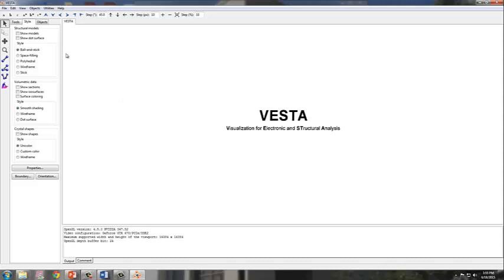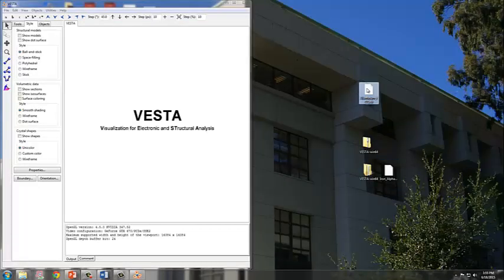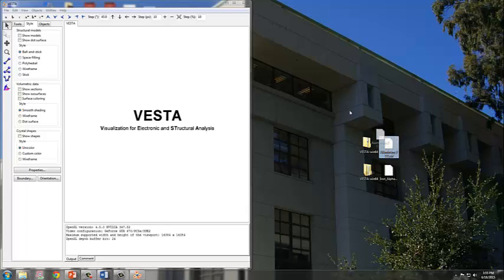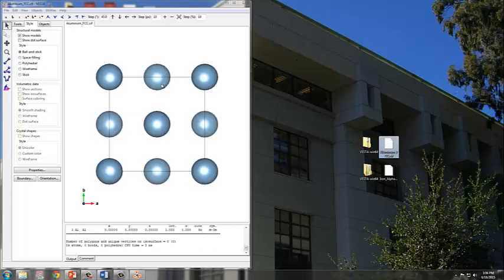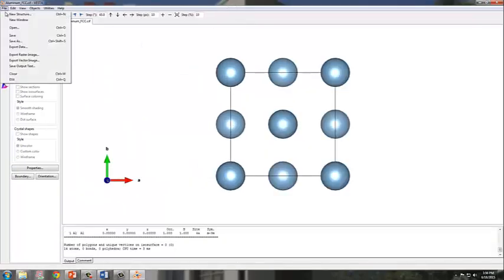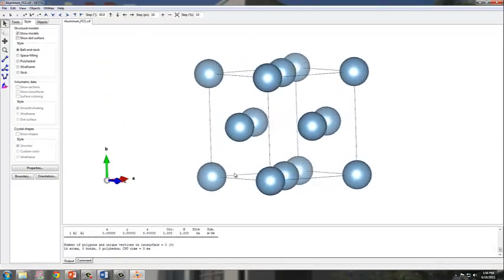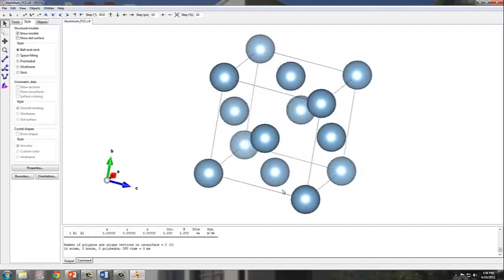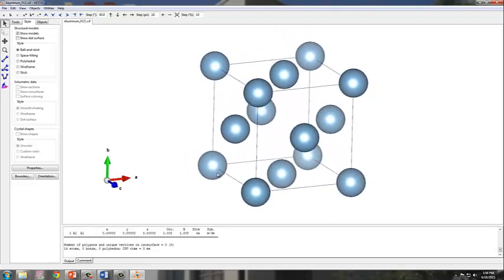There's two ways you can actually load the model. You can drag and drop. So here I have my file. I can drag and drop onto the VESTA program. See where it gives you the option to move? And then now you have the loaded file. Or you can also go to file and open the document.